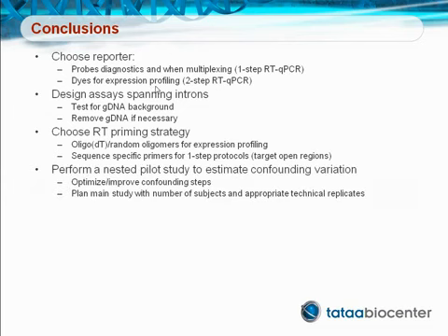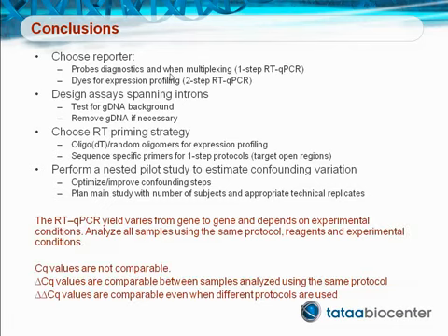Before starting a large study, perform a fully nested pilot to identify steps that contribute with most variation. Consider means to improve the performance of those steps. Use the result from the pilot study to design and cost optimize the larger study. Be aware that RT-qPCR yields vary among genes and depend on experimental conditions.